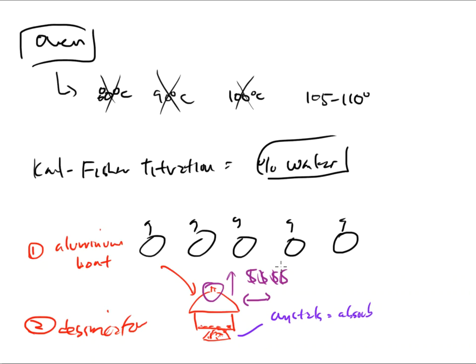I've shown you a moisture analyzer, very, very pricey, $4,500 or up to get a really, really good one. And we put these products into an aluminum weigh boat because they have to be heated. We get the mass before, we get the mass after. This gives me the gram of moisture, that I'm going to say water, but it's moisture from the sample, and we divide that by the weight of the sample in order to get the percentage.